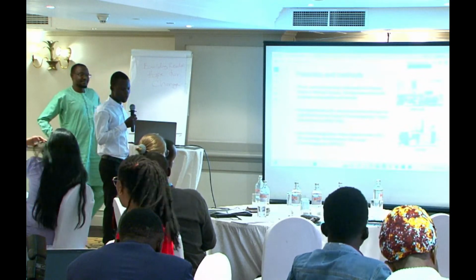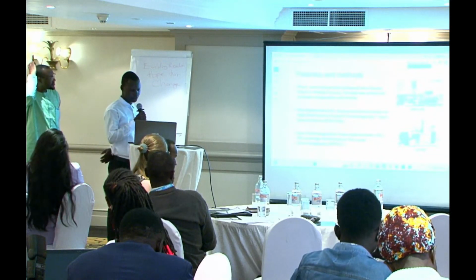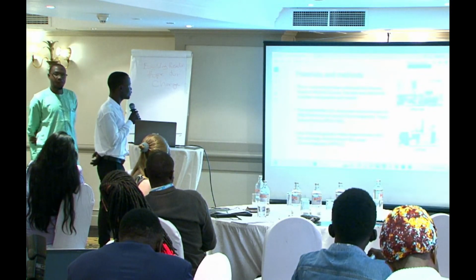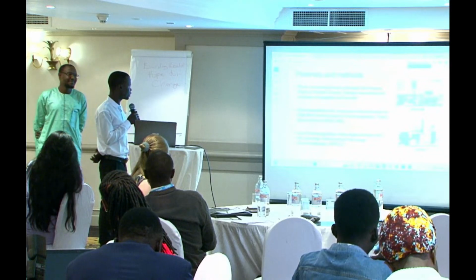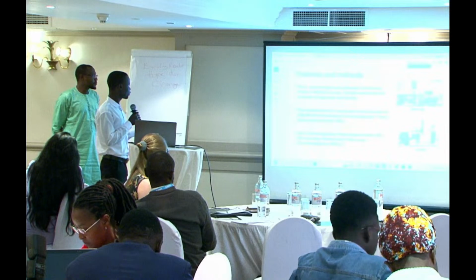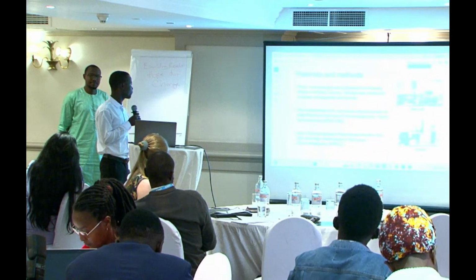Thank you. I'm going to take you through materials and methods. Aloe vera sample was collected from Karura Forest in Nairobi County. It was dried, then crushed using pestle and mortar.